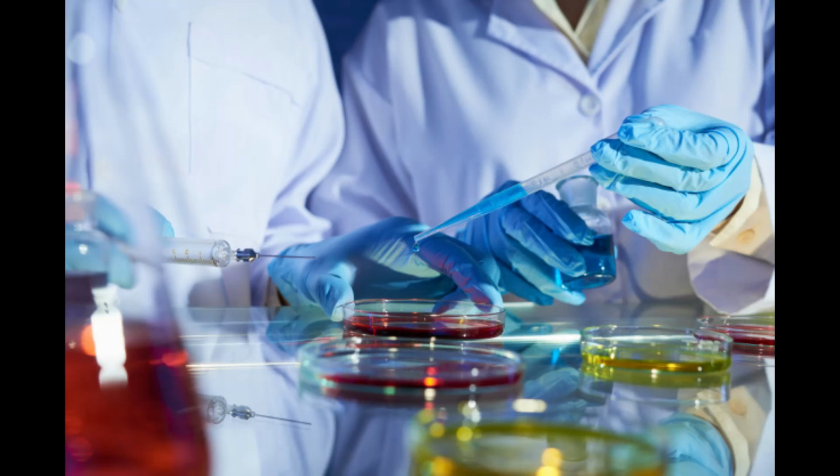The other page I gave y'all was page 600, and I do not remember why I have that written down, so let me look and see why. Oh, page 600 has the instructions for doing a deep stab on a deep tube.